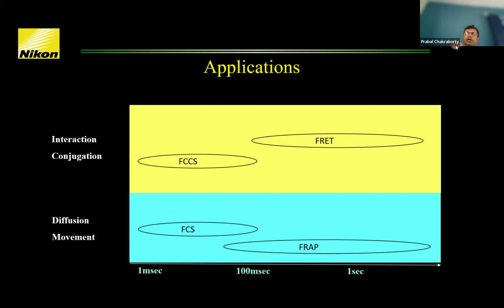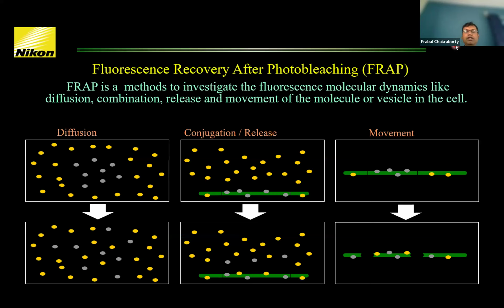Here I will very briefly discuss FRAP with just one slide. So you can see what we do. As I mentioned, if we illuminate a fluorophore molecule with high light, it will go to a permanently dark state, so it will not give any more fluorescence. We are using the same methodology here. We first scan one image and make a small ROI in the software.